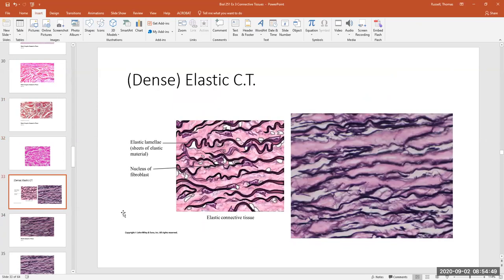Let's get into the last of the dense connective tissues — elastic connective tissue. The identifying characteristic is dark fibers with a little squiggly to them — these are the elastic fibers. Elastic connective tissue is loaded down with elastic protein fibers. When you start seeing thick wavy lines like this, you know you're looking at elastic connective tissue.